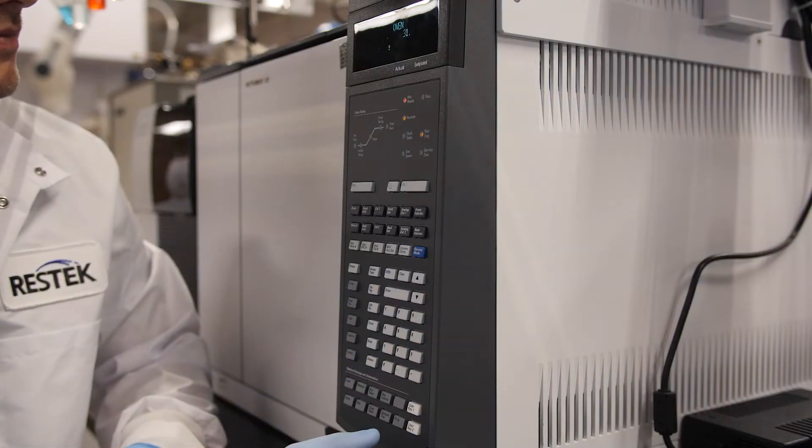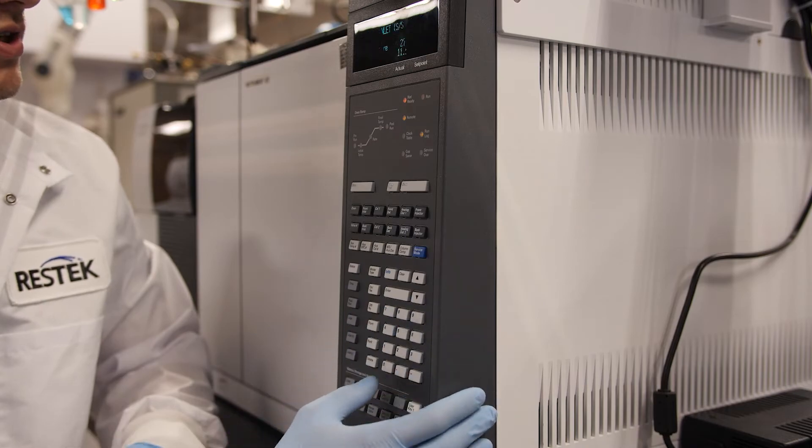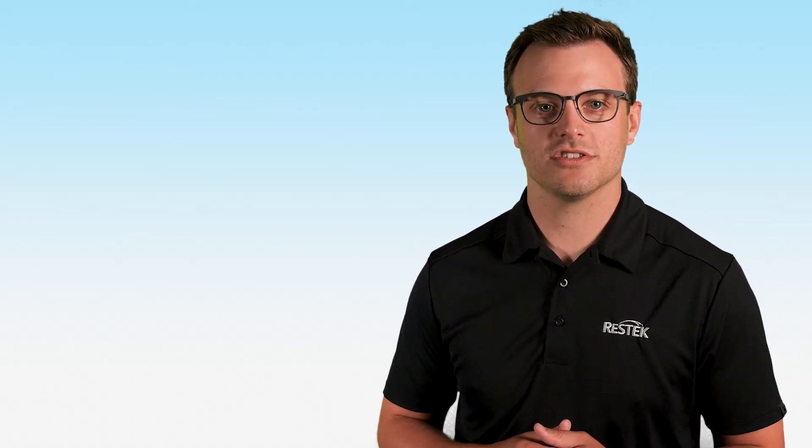Now that everything has been installed, we can restore the instrument to normal settings, condition these new inlet parts, and start running samples. And that's it — you're done. That's how you prepare your GC to use SPEMI Arrows.